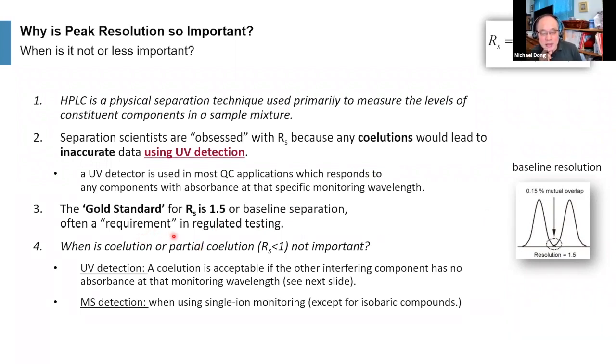Now, it is a requirement in something called regulated testing. Regulated testing means that the testing is really important and is also regulated, meaning that it is controlled by a regulatory agency, such as the US FDA, Food and Drug Administration, or EMA, European Medicines Agency, right? So these are the two regulatory bodies in Europe and in America. For people doing generic drugs, probably the USP, United States Pharmacopoeia, is kind of like a regulatory agency, but it's really not a true legal entity, right? It is a consortium that everybody in generic really has to conform to. It is a monograph. If you have to say that your OTC drug, over-the-counter drug, is USP, if you want to label USP, you have to use their monograph.